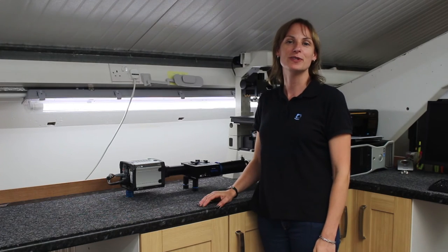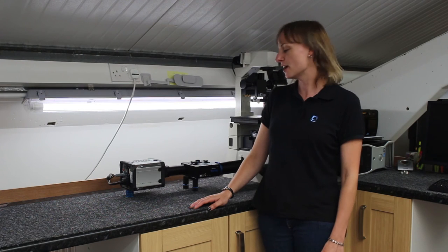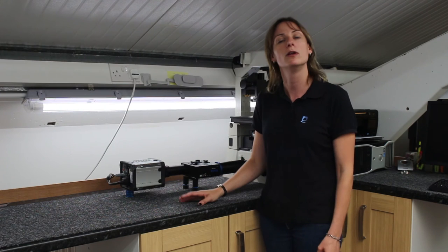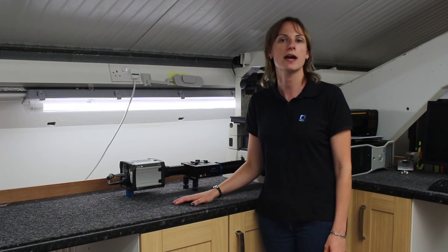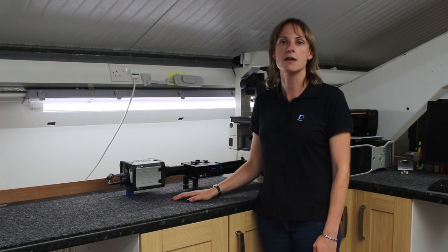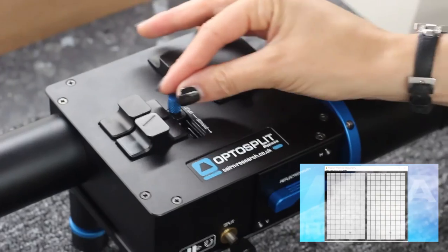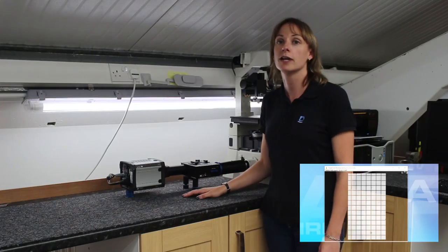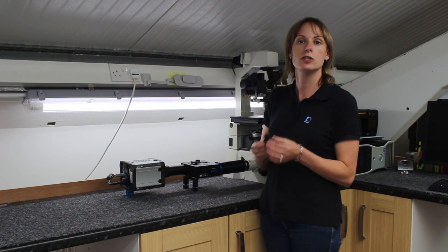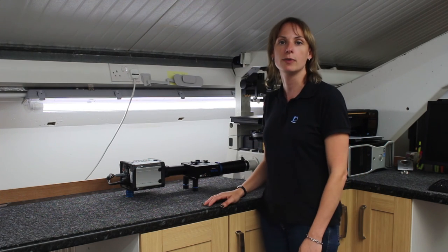The third key improvement with this Bypass unit — well, the clue's in the name, it's a Bypass unit. Many customers have split requirements, but there are also other users that want a full field image. Particularly on a large sCMOS camera, they want to utilise that whole region and don't really want to remove the unit and disturb the camera. So we've introduced an additional mirror which can slide into the light path, which blocks the short wavelength channel. The addition of angled filter holders allows you to put your emission filters in this section and move your mirror into place for a Bypass step.